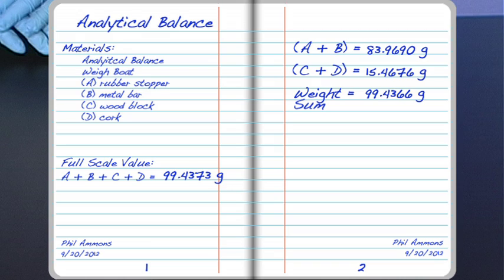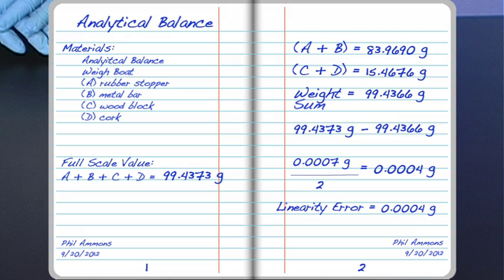On our balance, the two values are not equal. Let's take the difference. 99.4373 grams minus 99.4366 grams gives us 0.0007 grams. Because we took two measurements, let's divide by two, which gives us 0.0004 grams. Now we have successfully identified the linearity error at the balance's midpoint.